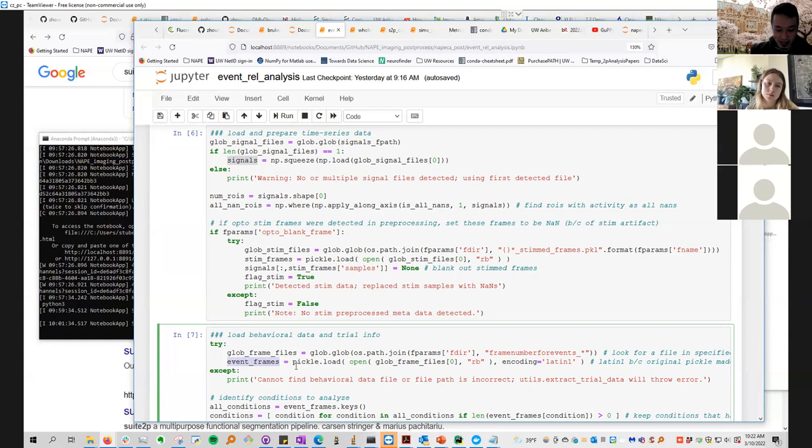One idea is to have a CSV where the first column is the event type, and the second column is the time point that the event happens. That should simplify the loading in of the data. But we can talk about that after this next last code.